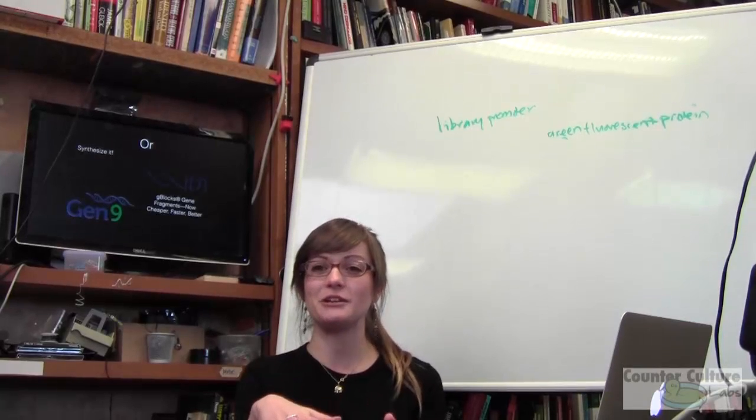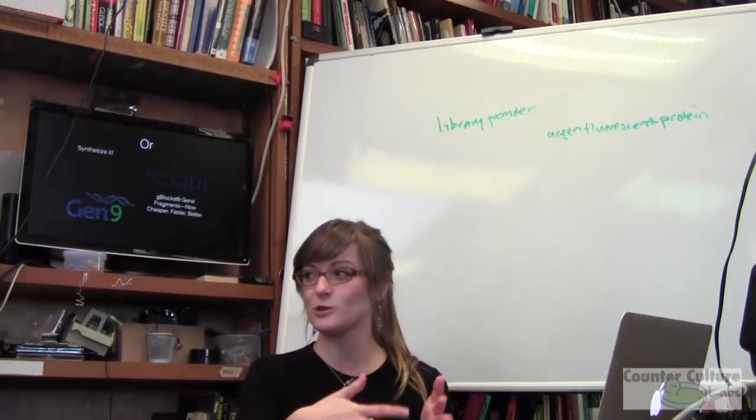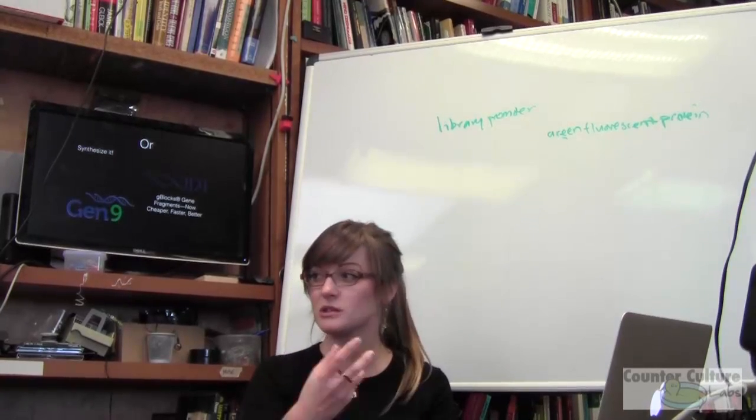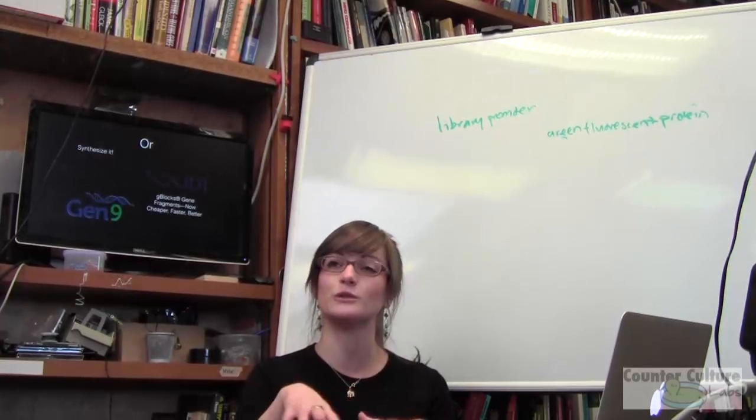But from Gen 9, I don't know if they always do, but they'll send it in liquid. IDT, everything I've received has always been just lyophilized. They do not put it in the organism for you.